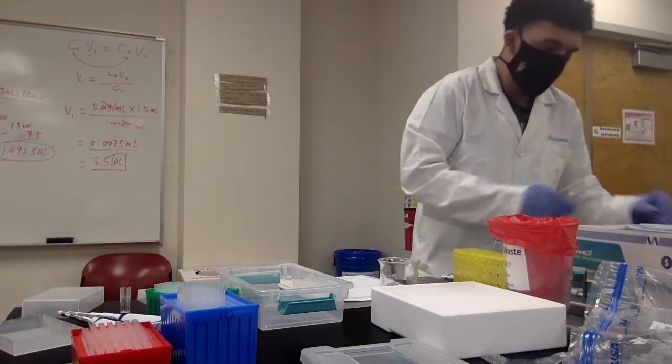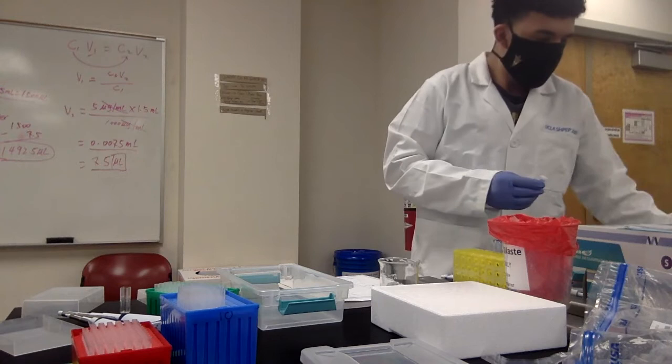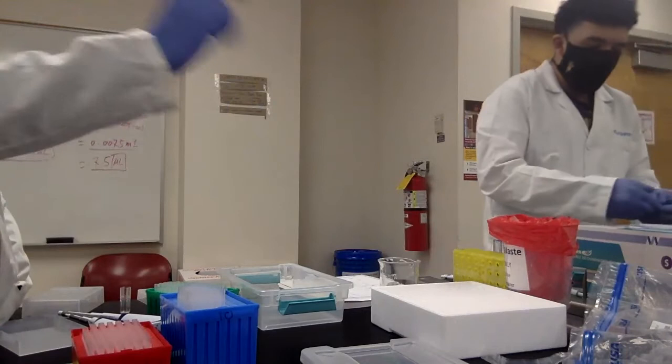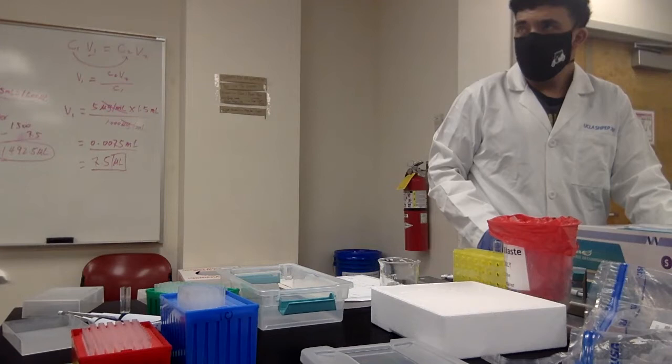Now you've finished the great stuff. You can invert it just in case, just make sure you mix it completely. Make sure the color looks homogeneous. After that, you transfer this solution from your tube to the cuvette. Do I use a pipette to do that? You can pour it or use your pipette to transfer it.